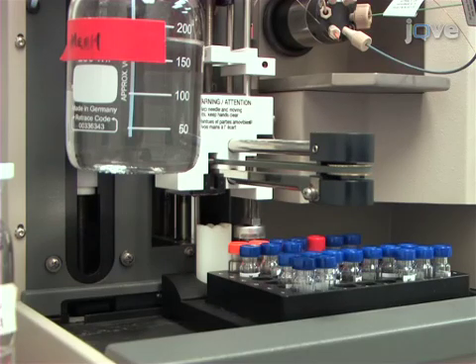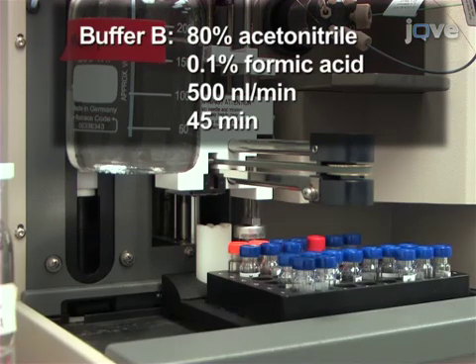After a wash step, switch the valve and deliver a 0 to 50% linear gradient of buffer B to the trap and the C18 separation column.